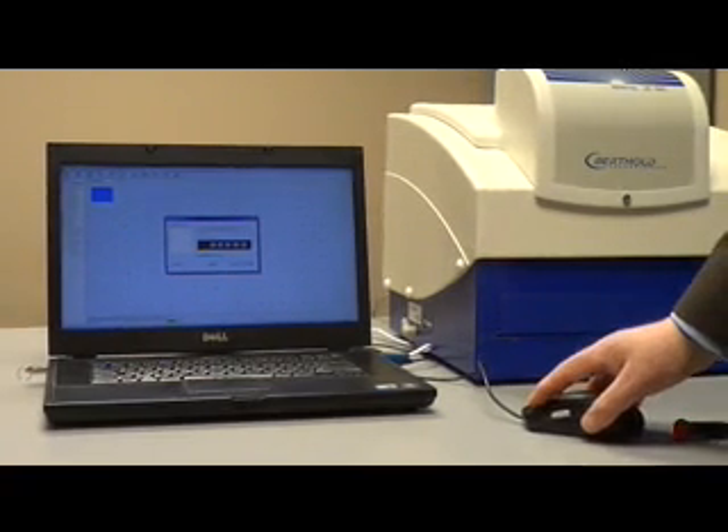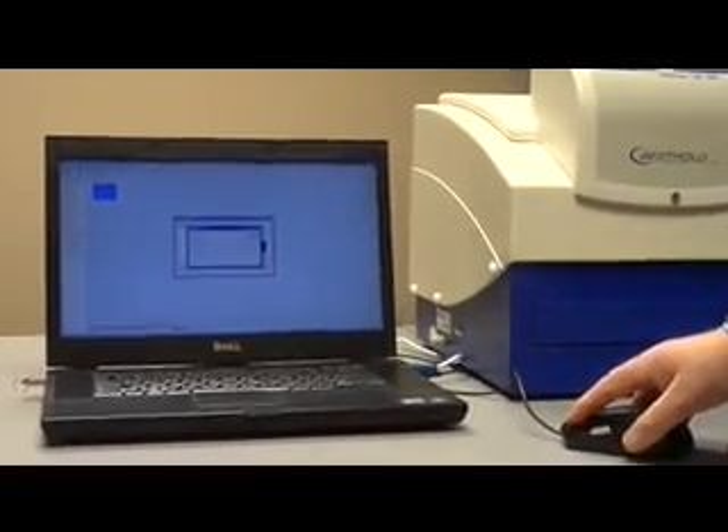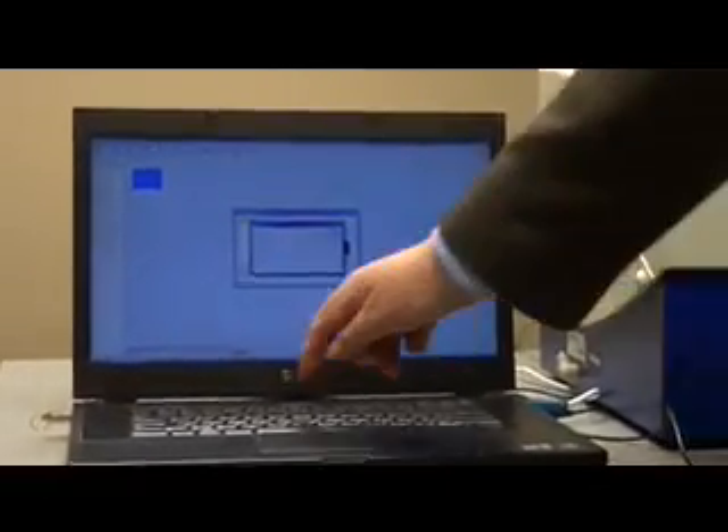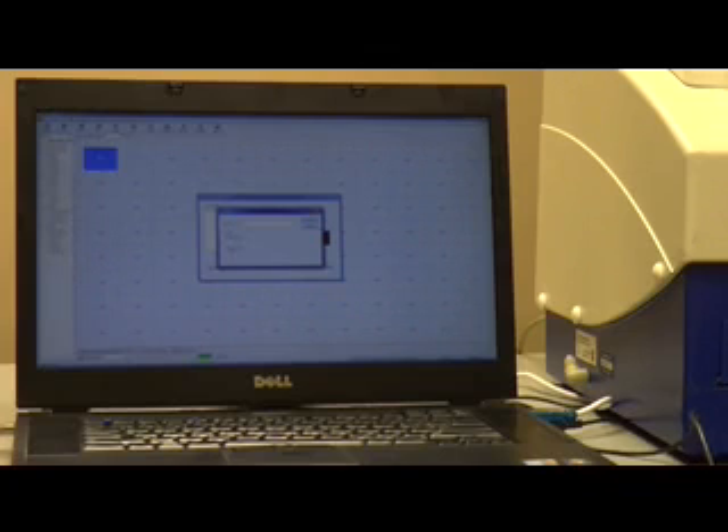Now we have to add a filter. Here we can name it — I'm going to name it 485 nanometer. If you want to use it for fluorescence, click Fluorescence. Or if this was an absorbance filter, you can also click Absorbance. Then click OK.